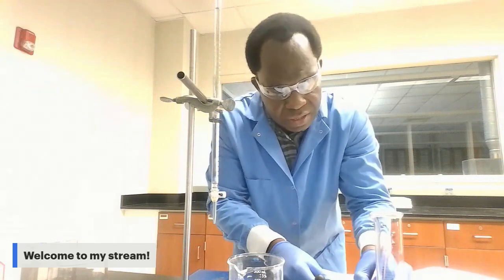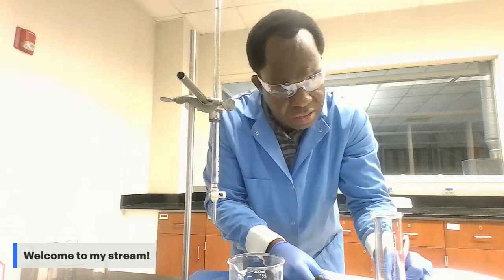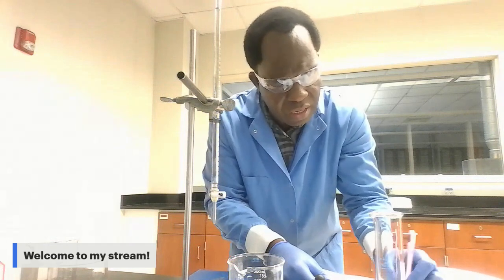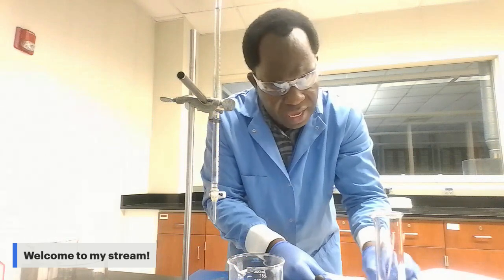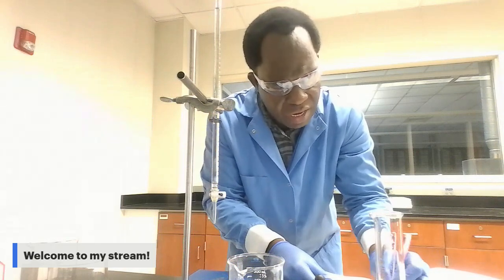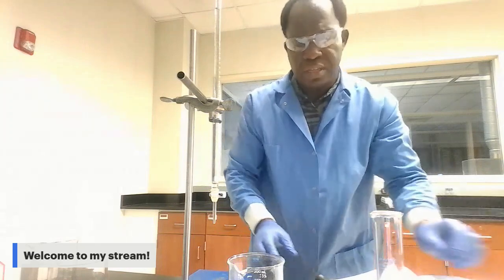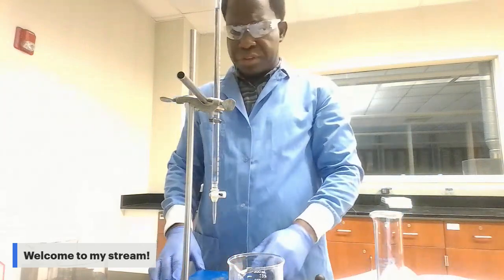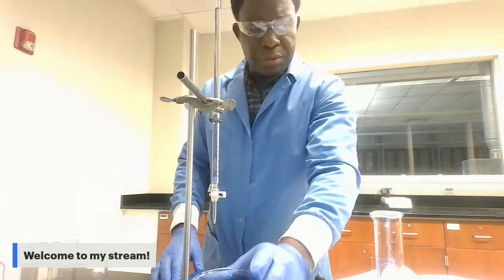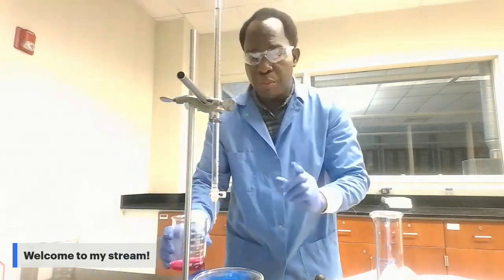So 15 milliliter minus 0 milliliter is equal to 15 milliliter. It means that I use a volume of HCl equal to 15 milliliter to titrate the CaOH2 solution at equivalence point.